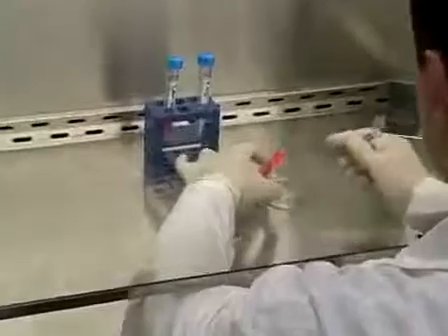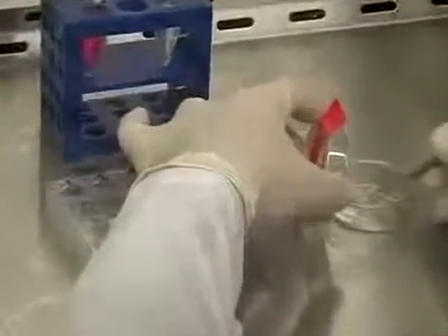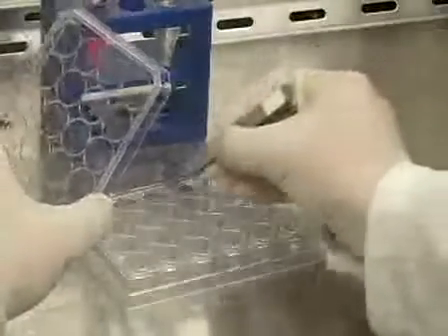First, I'm going to place three sterile German glass cover slips that are 12 millimeters across into a 24-well plate in order to coat them with laminin. Now I have my cover slips in the plate.